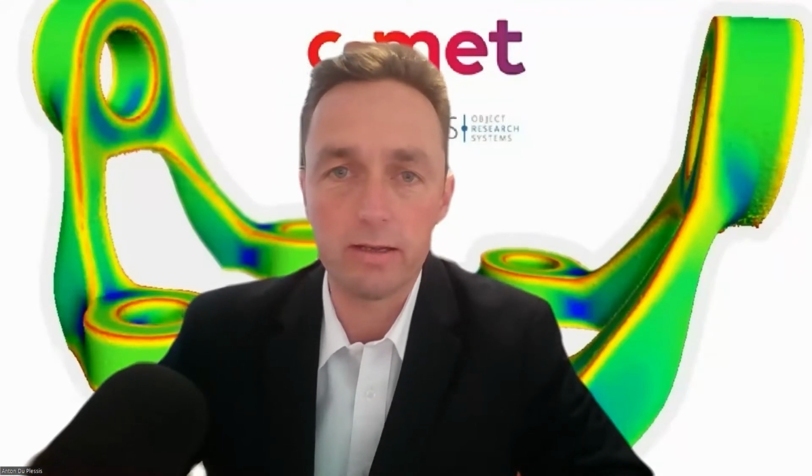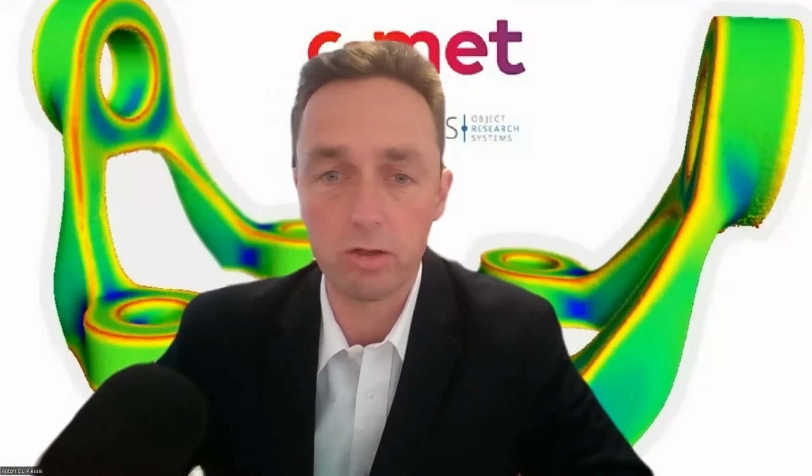Okay, welcome back. So in this video, I'm going to load up a fiber data set. And in this case, I want to demonstrate a few things, including some more segmentation tools and some shape tools. And then following on that important topic of watershed segmentation, which is something very useful when you're trying to separate objects such as touching fibers. All right, so let's see if we can get through all of that.